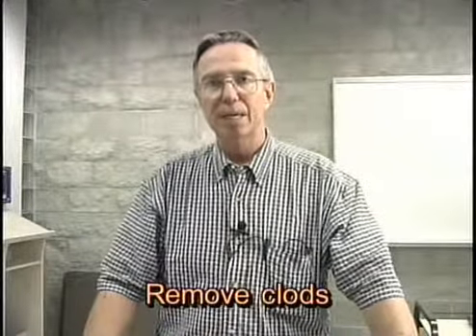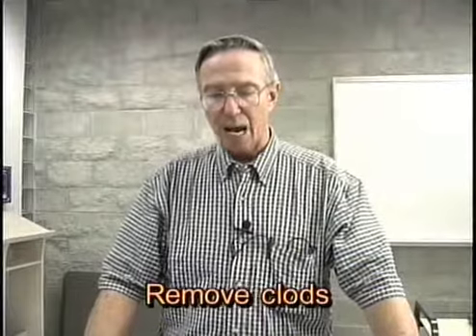As we go through this lab, I will be demonstrating the procedures used to determine texture by this sedimentation method, similar to what I did in the introductory lab to this course, where I determined soil texture by feel. In order to determine soil texture by sedimentation, we need to use a 50-gram sample of soil. This sample needs to have the clods or aggregates removed. So I will use a mortar and pestle to remove the aggregates or clods in the soil sample and then weigh out 50 grams of soil.